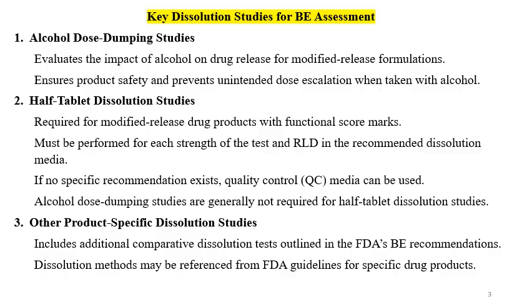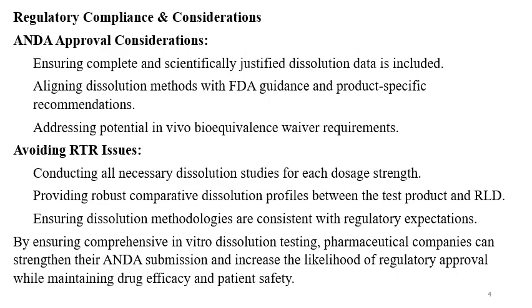Other product specific dissolution studies include additional comparative dissolution tests outlined in the FDA's BE recommendations, that is, product specific guidelines for the BE studies. Dissolution methods may be referenced from the FDA guidelines for the specific drug products.